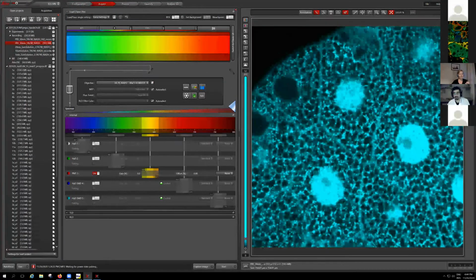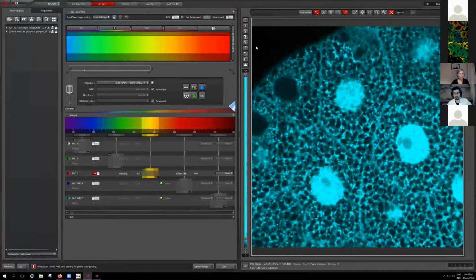Can I say something? Yes, sure, go for it. Yeah, so we did a lot of experiments on fixed versus live cells, particularly for FRET. Because if you do RNA on GFP-labeled proteins, it's difficult to use live samples, and we had to use fixed cells. We did some FRET work with RNA and protein interactions.